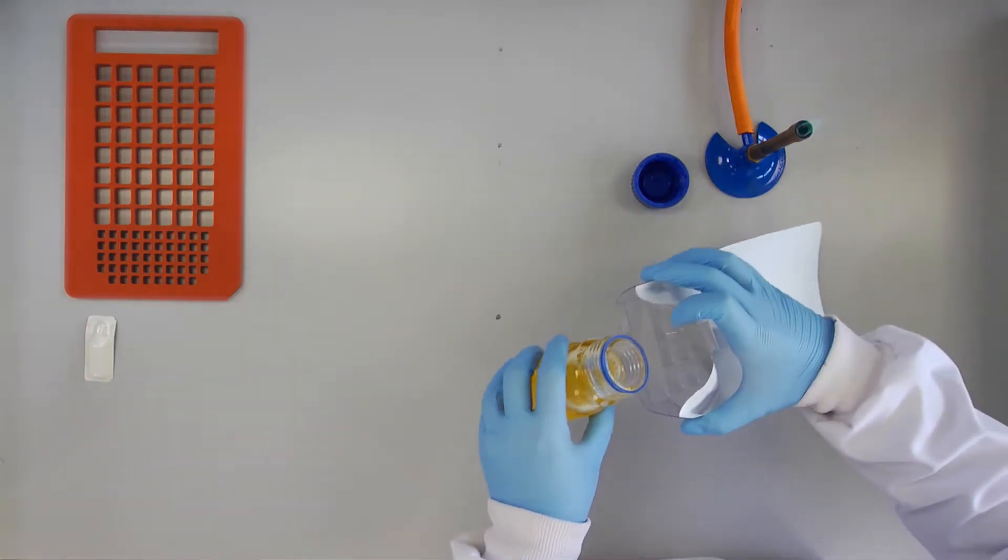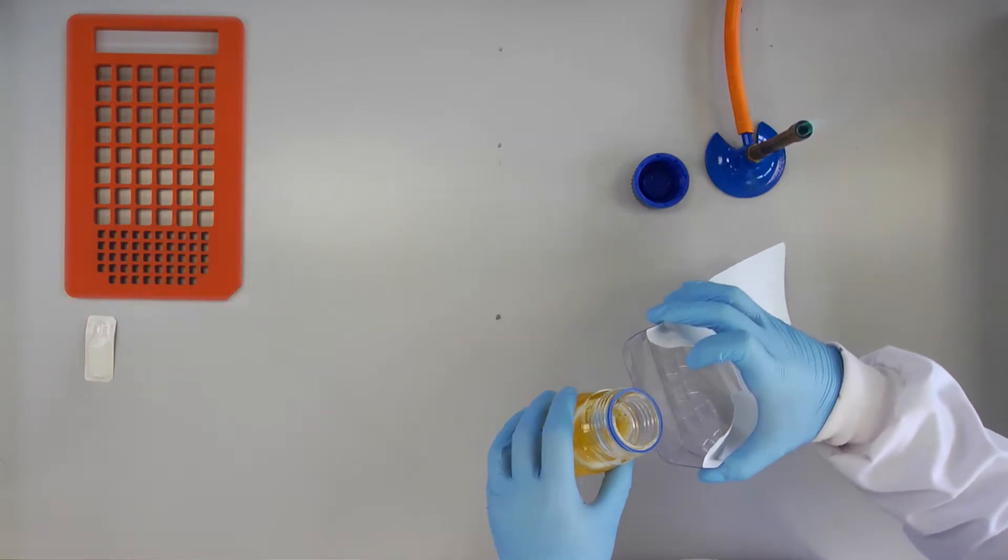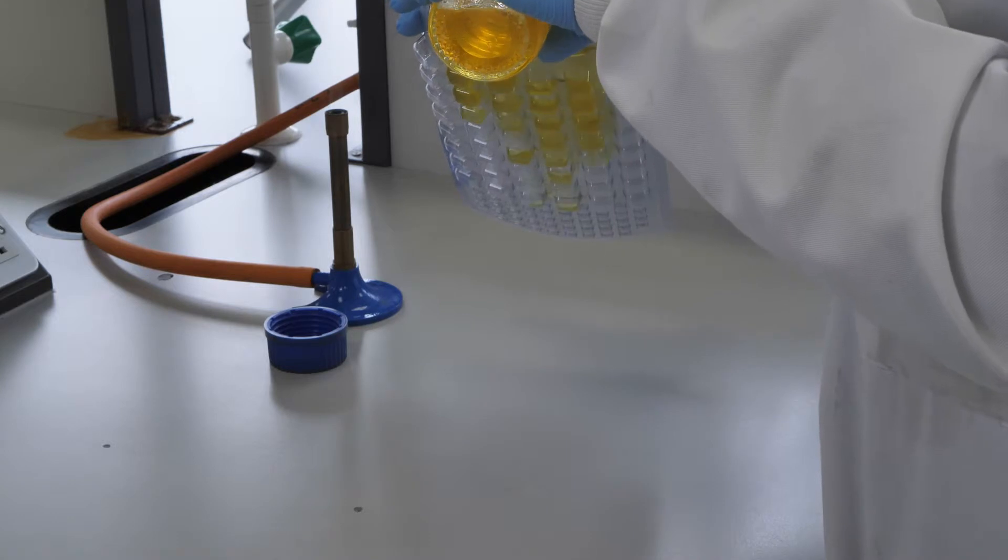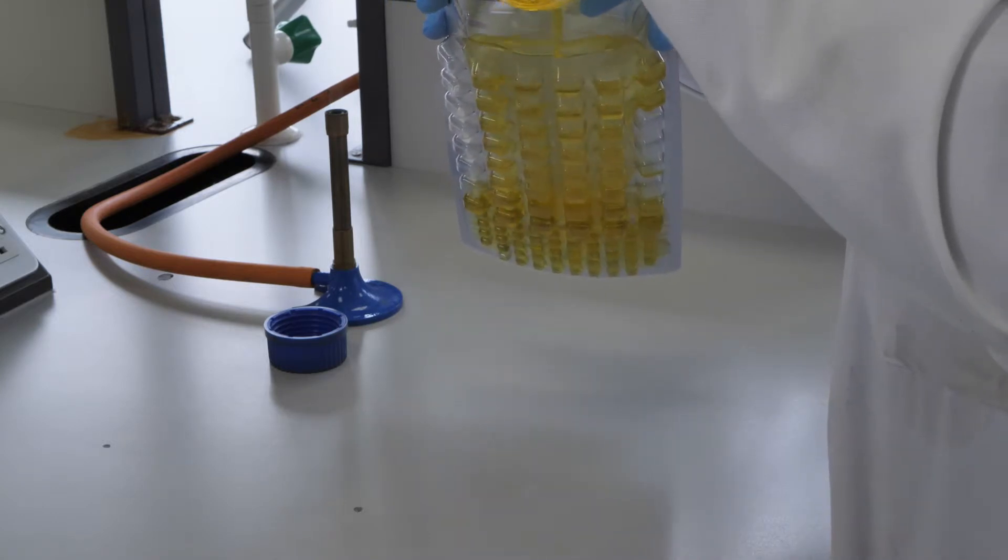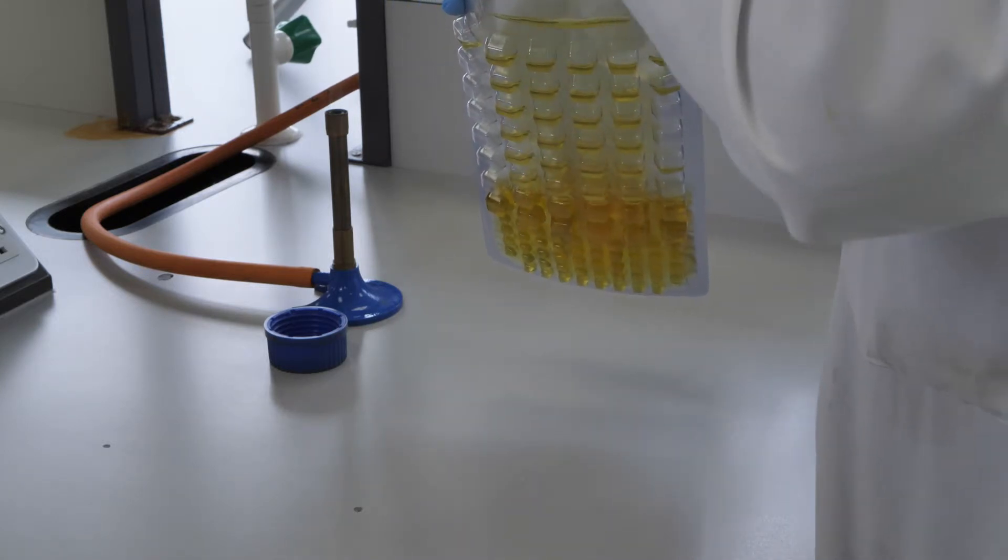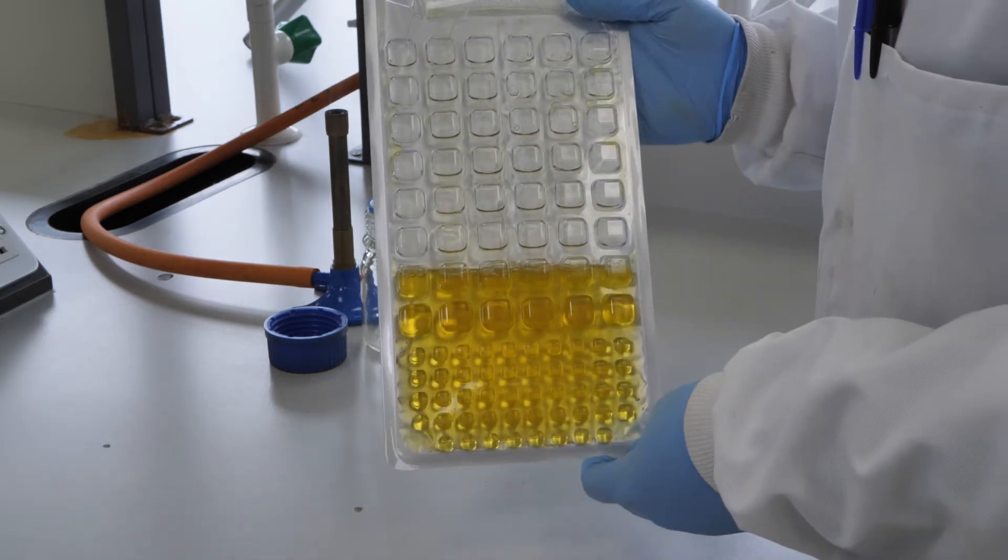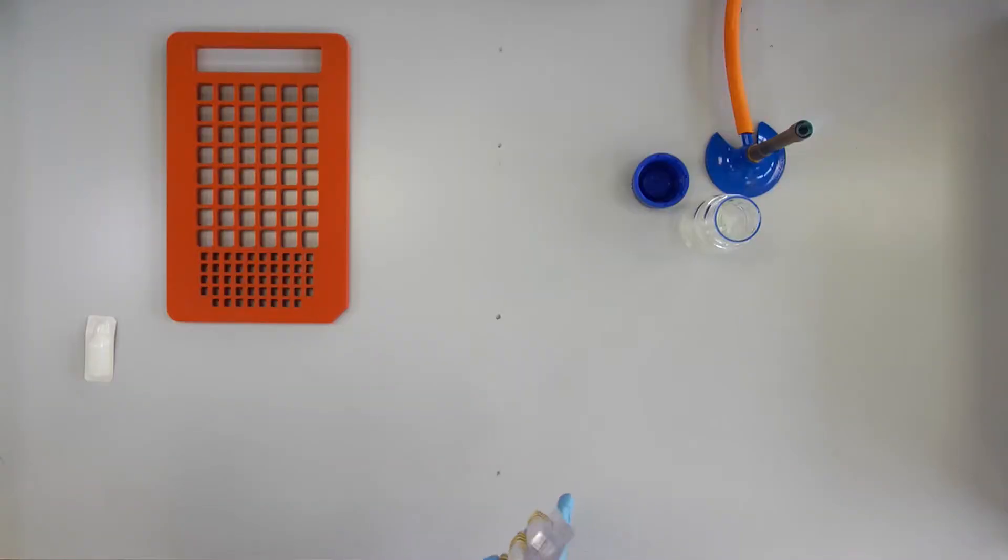Squeeze the upper part of the Quanti-Tray so that the tray bends. Pour the reagent sample mixture directly into the Quanti-Tray. Avoid touching the inside of the foil or tray.